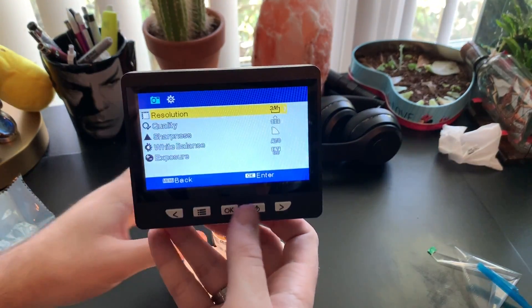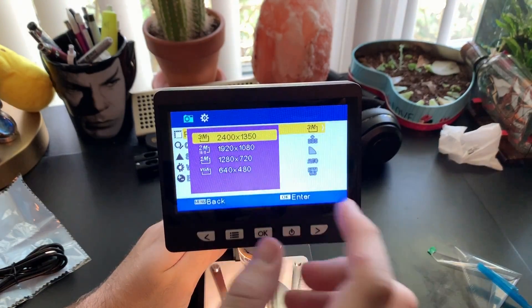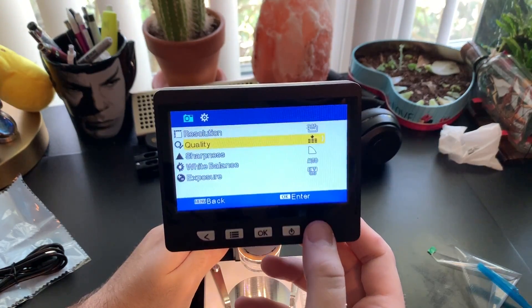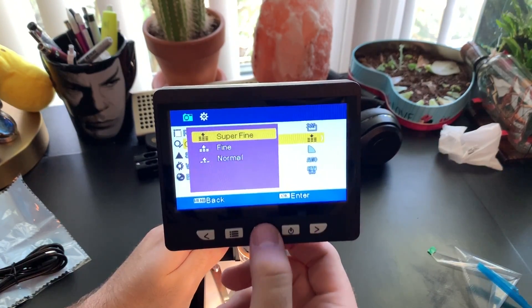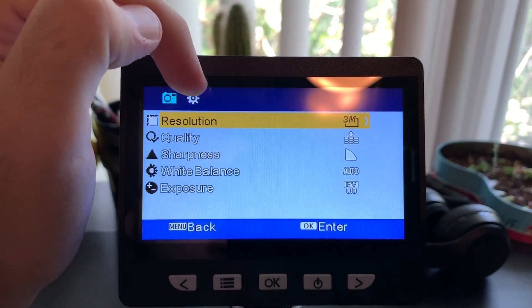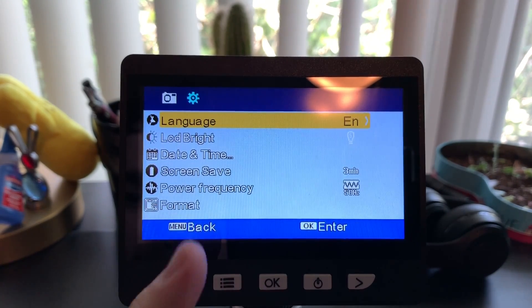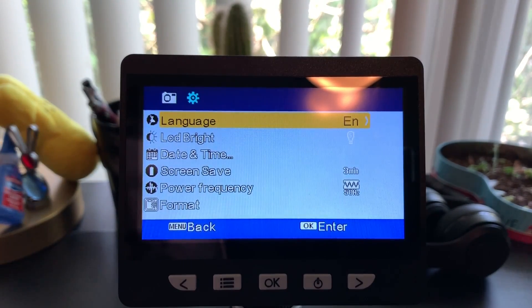Let's take a look at the screen and put that bee wing on there. You can see the resolution is adjustable — there are different settings you can cycle between. You have quality settings: super fine, fine, and normal. You also have sharpness, white balance, and exposure. Pressing the power button once takes you to the gear/settings menu where you can change the language, LED brightness, date and time, screen saver, power frequency, and format options.